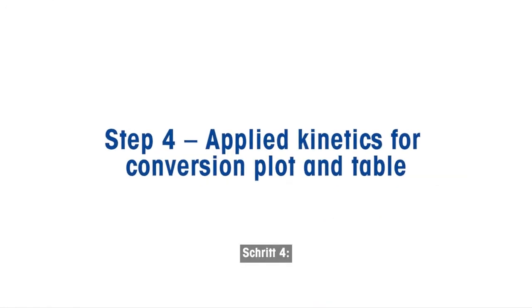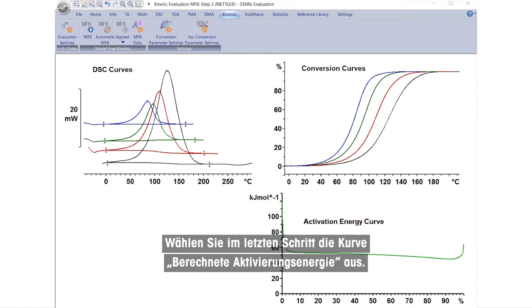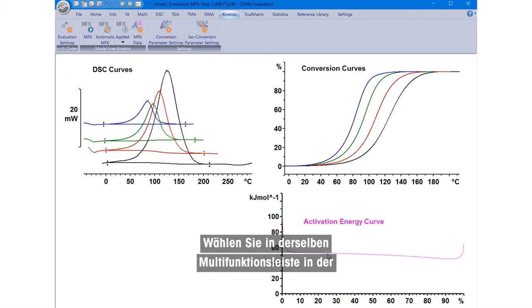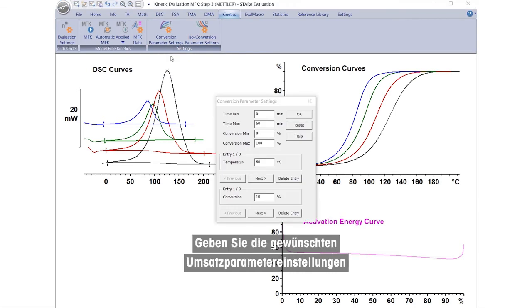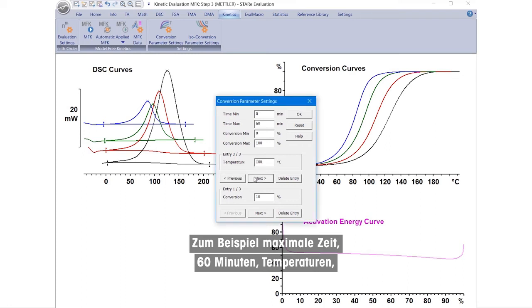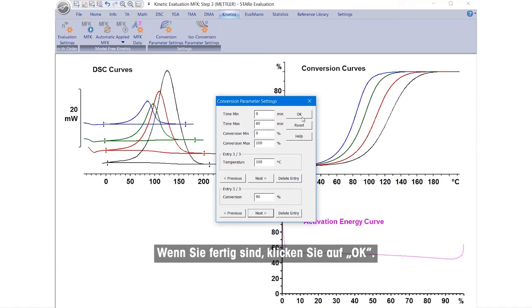Step 4. In the last step, select the calculated activation energy curve. In the same ribbon bar, select Conversion Parameter Settings from the Settings group. Specify the desired conversion parameter settings in the pop-up window's entry fields. For example, maximum time, 60 minutes. Temperatures, 60, 80, and 100 degrees Celsius. Conversion, 10%, 60%, and 90%. When finished, click OK.